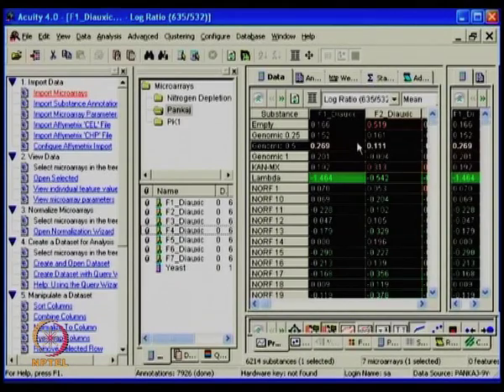The black color is towards 1. The meaning is that when you look at the data, when the green and red channels both give the same intensities, it becomes blackish in color. If they are upregulated, people put them towards the red color, and if it is downregulated, a minus sign is given and it becomes green. The idea is which laser is being used for what. In context we have shown which kind of ratio you are using to check. Usually it is case over control that people report. In this fashion, conventionally you can see the colors.